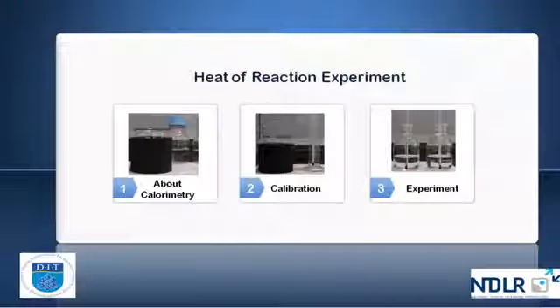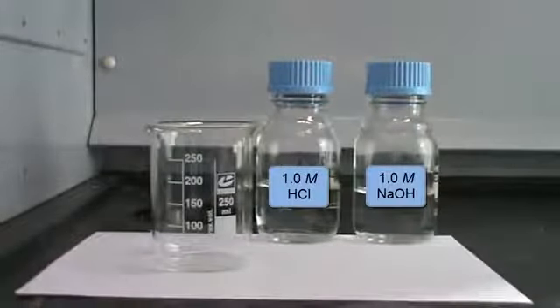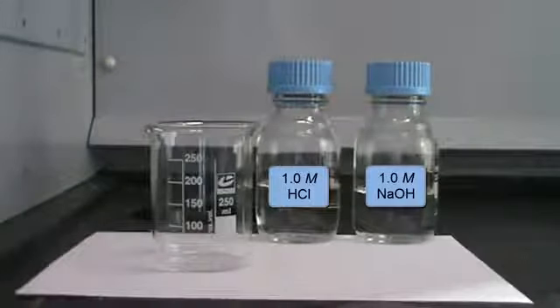In this video we're going to look at the heat of reaction experiment. In the heat of reaction experiment we're going to mix two substances, in this case an acid and a base. We're going to measure the heat of reaction that's given off on mixture.